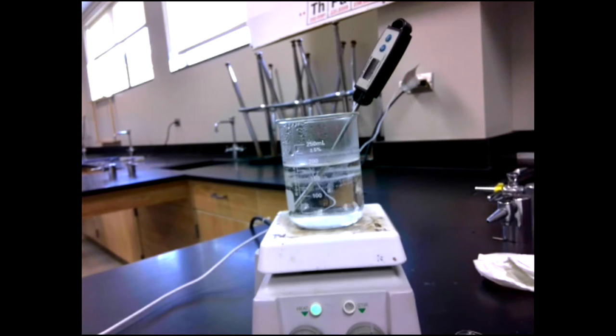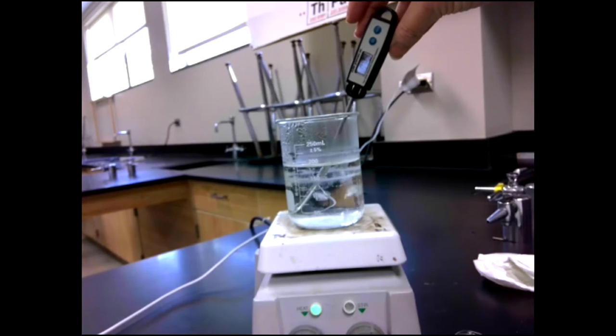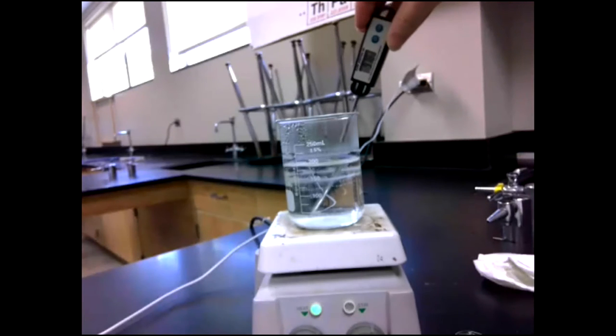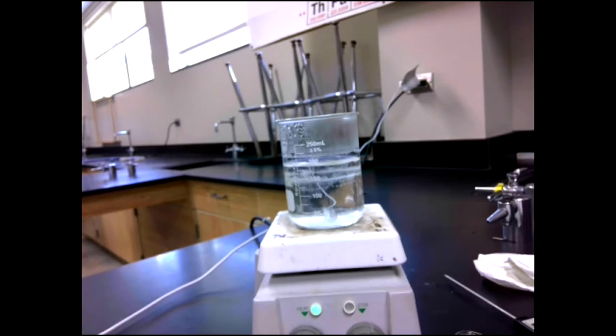Let's see. We'll let it really boil. Come on. 98. All right, now it's 98.7. It's fluctuating. It's good enough. It's boiling. We're good.